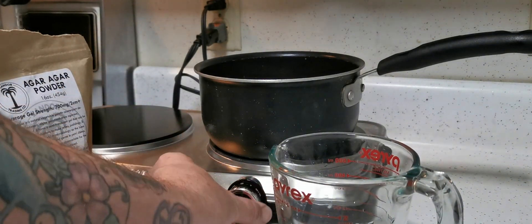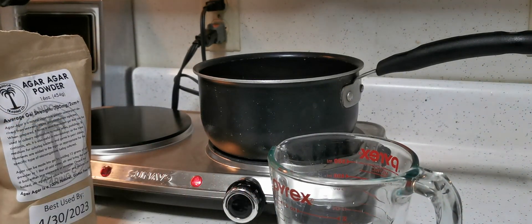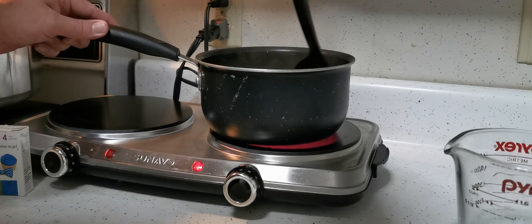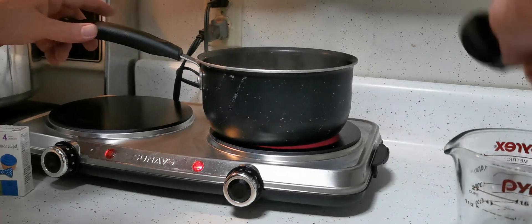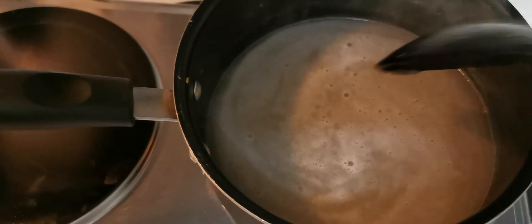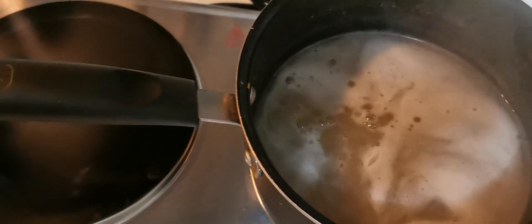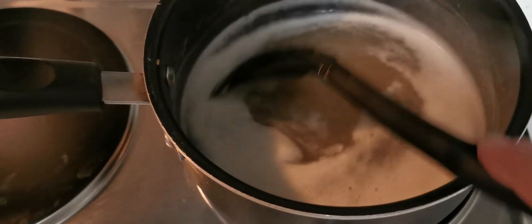Now we want to get this mixture boiling, but you want to stay close to it and watch the heat. Once it starts to boil, it'll foam up and leave the pot, giving you a big sticky mess. Once it clarifies a bit, that will let you know that everything is fully dissolved. Now that we're boiling, we're going to turn the heat down just a bit — we want a very gentle boil.